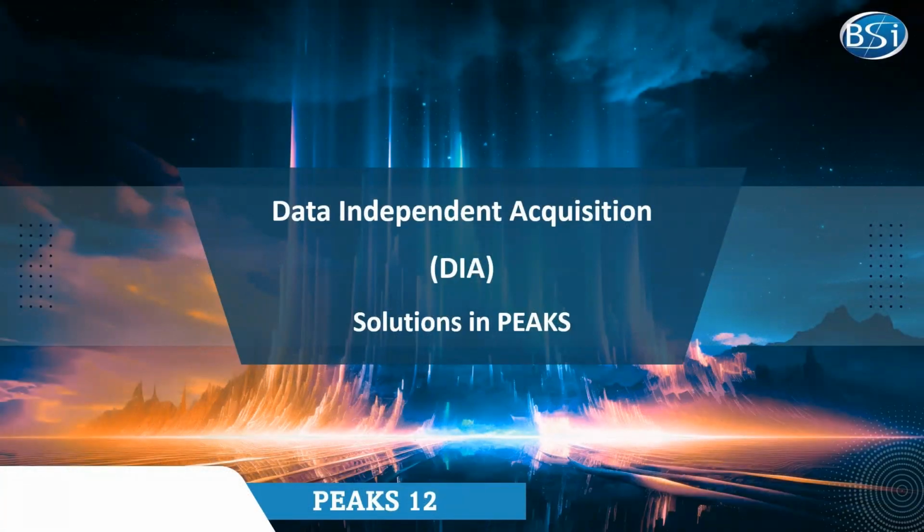Welcome to the Peaks Studio 12 DIA video tutorial. In this video, I will be going over the DIA workflows available in Peaks 12, how to set up the identification and quantification workflows, and how to view and export the results.